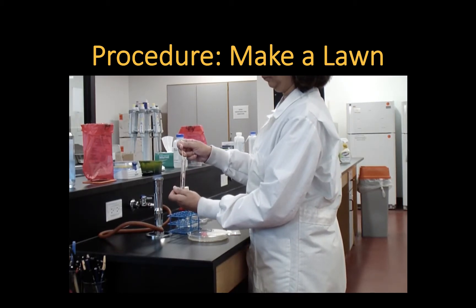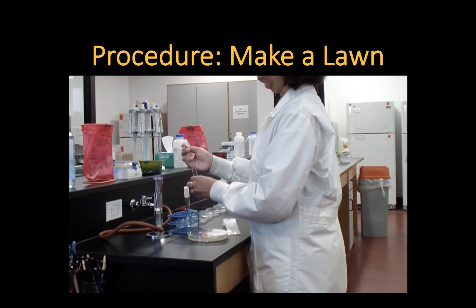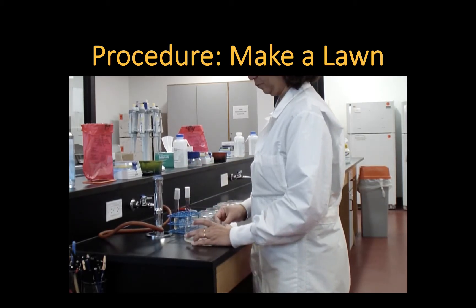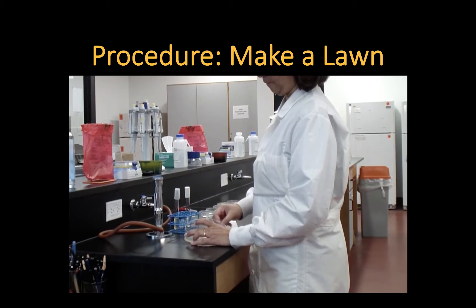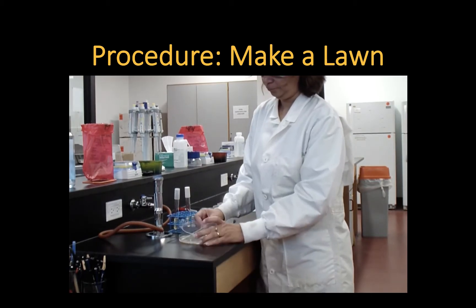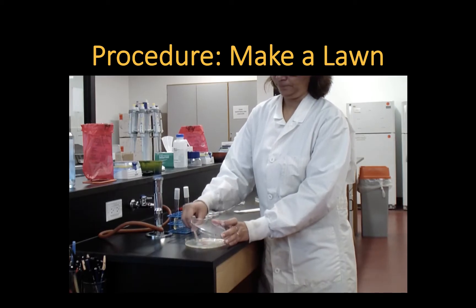Saturate the cotton swab with the bacterial broth, pull it halfway out and squish it to the side. Now with the saturated cotton swab, you're going to make even overlapping strokes on the surface of the plate, making sure you cover the entire surface.